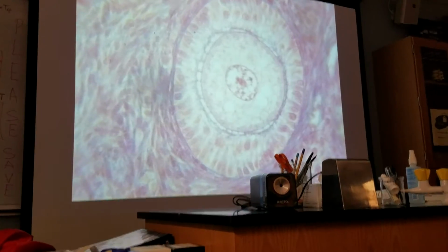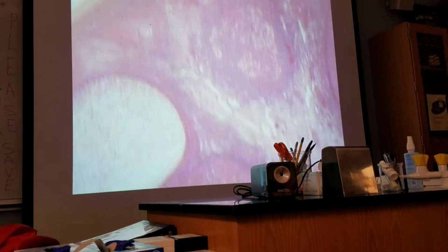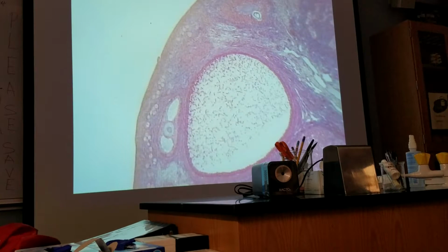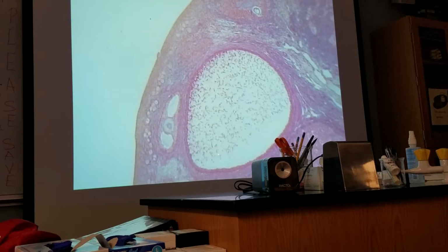There are several small and large secondary follicles, and I'm taking you there. Here, this is a part of a secondary follicle with the antrum.